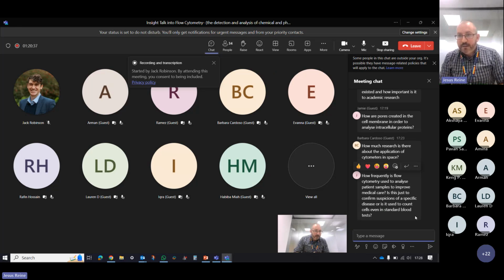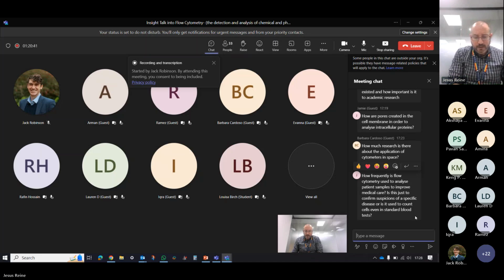And in particular for medical care, it's really relevant because especially for people who are under specific treatment, we can use the same panel to see how that person improves over time. So we can see if specific populations are responding properly to a very specific antigen during different sessions of a specific treatment.